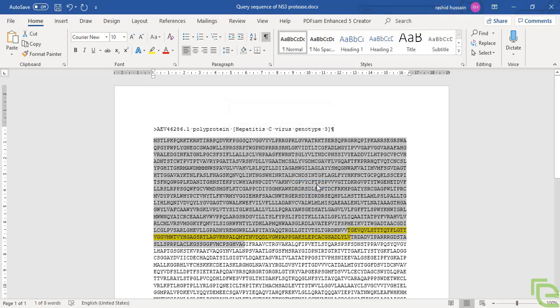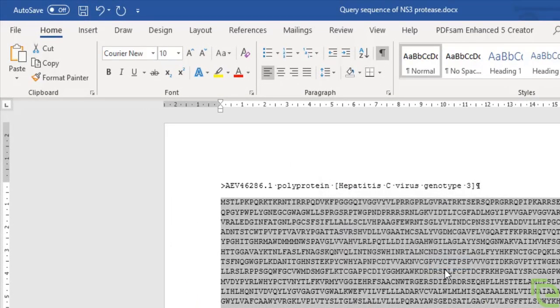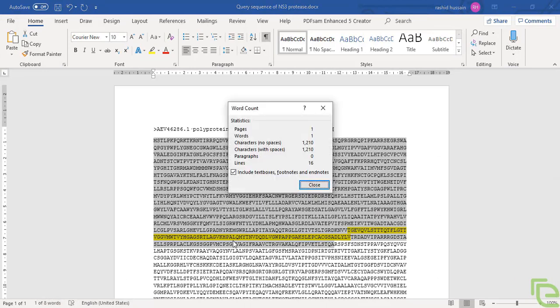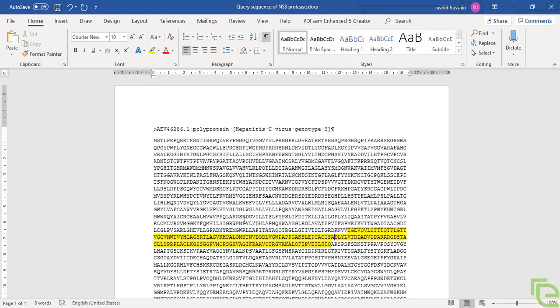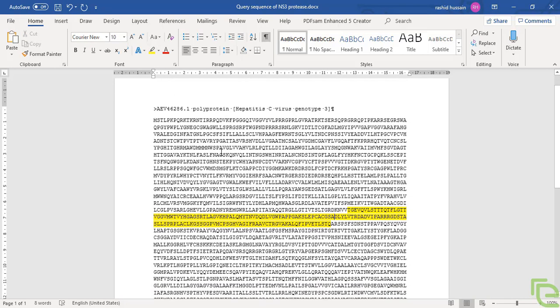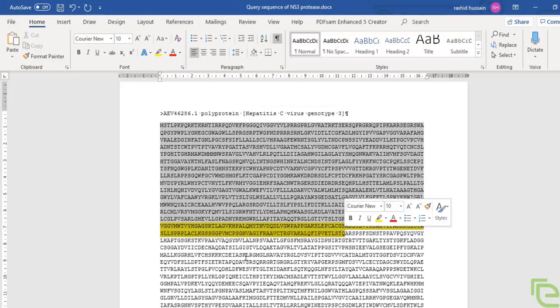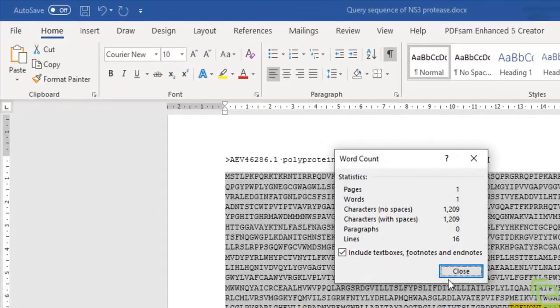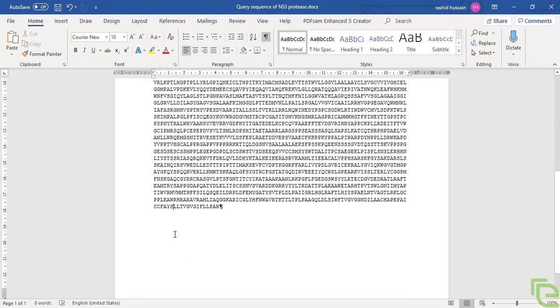This highlighted yellow region is the sequence for NS3 protease, from residue 1061 to 1209. We'll copy the highlighted region — this is our query sequence that needs to be modeled.